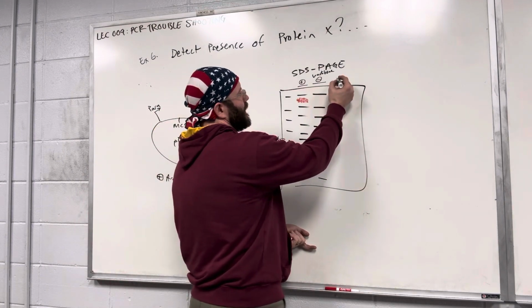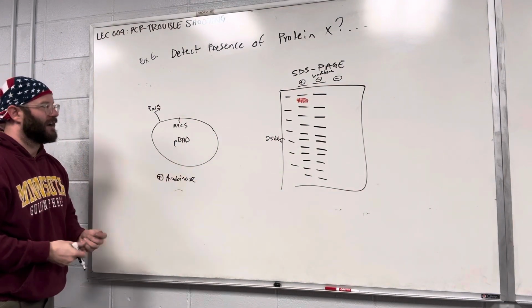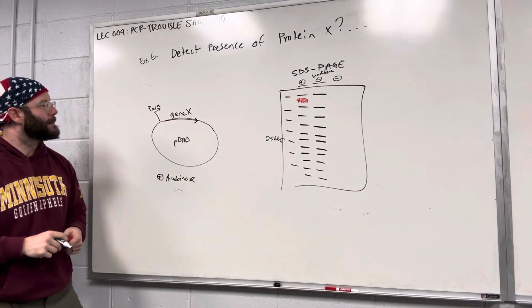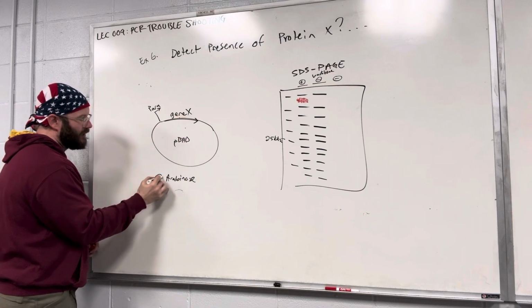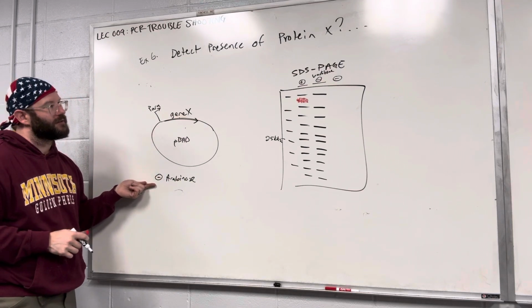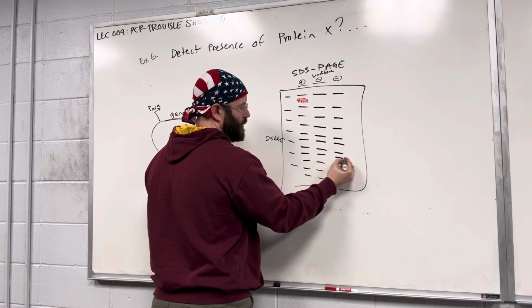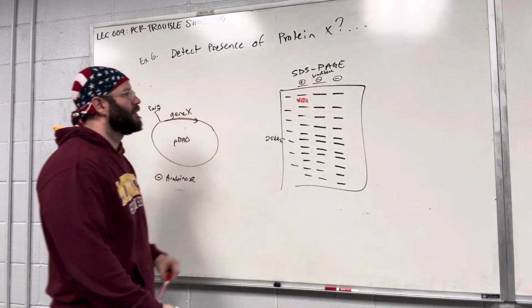There's actually another really good negative control. What would be another negative control using this construct? No arabinose? Yes, that's the most useful negative control, is you run the experiment, except you don't add arabinose to induce. Then you're gonna get similar. It's gonna look like this. The pattern will be the same, okay? But you have not induced that protein.